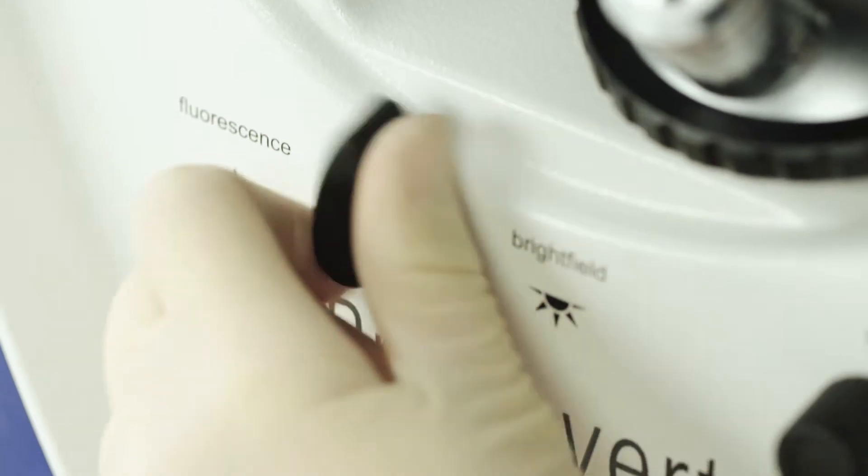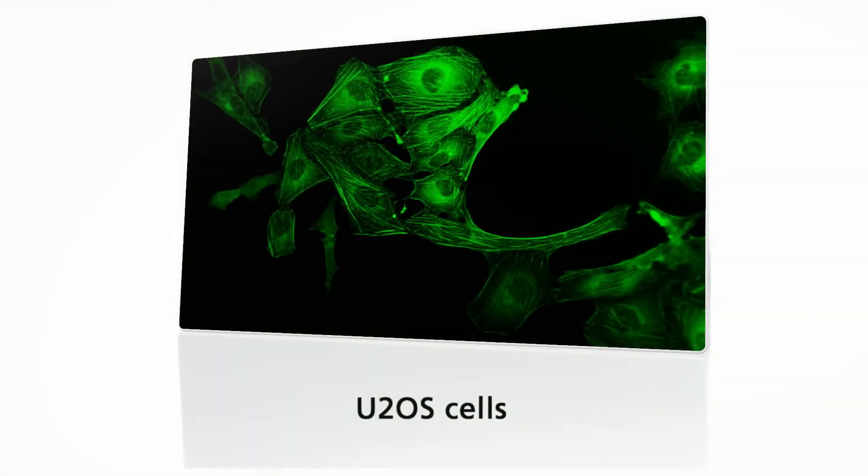Or with just one setting, simply switch to fluorescence contrast to observe cells marked with GFP.